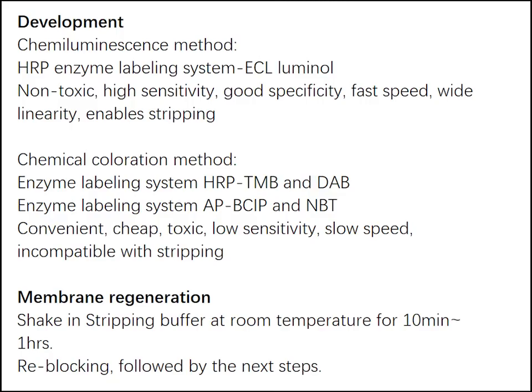The advantages and disadvantages of the chemiluminescence method and chemical coloration method of the development are listed as above. If your protein sample are very precious, you can consider use the membrane regeneration. Just shake it in stripping buffer at the room temperature for 10 minutes to an hour and reblocking, and then followed by the next steps.